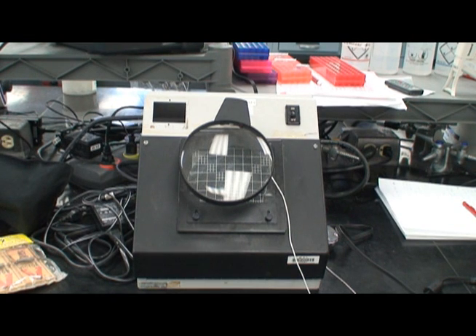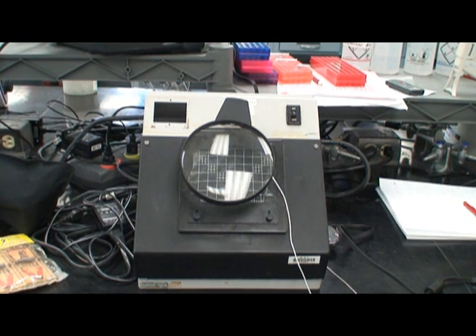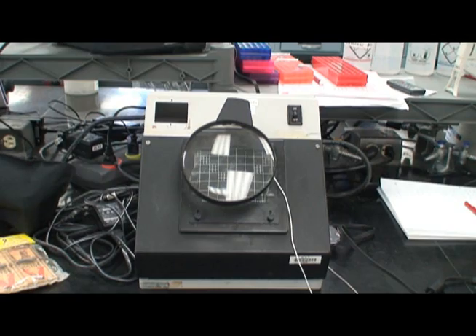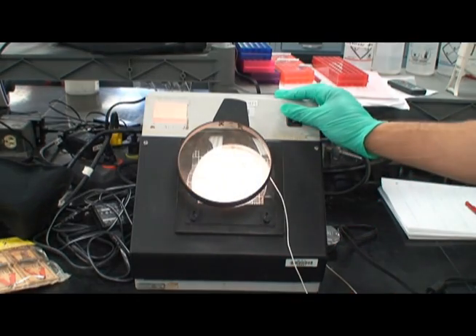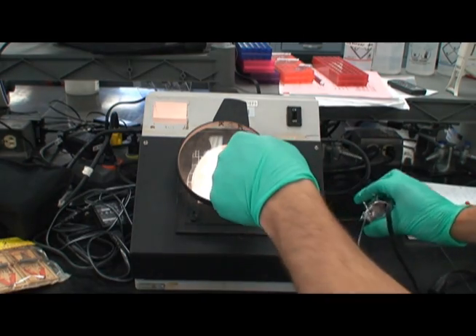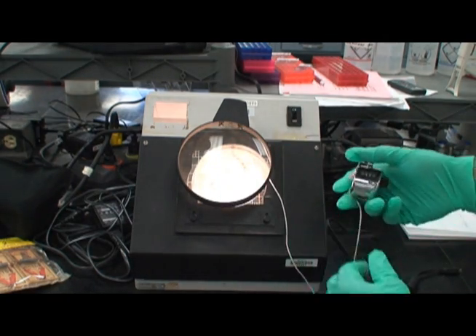Following incubation, a light box can be used to count the colonies. By looking through the magnifying glass and using the counter to keep track, the number of colonies on each plate can be recorded.